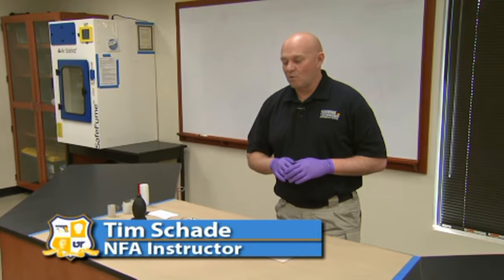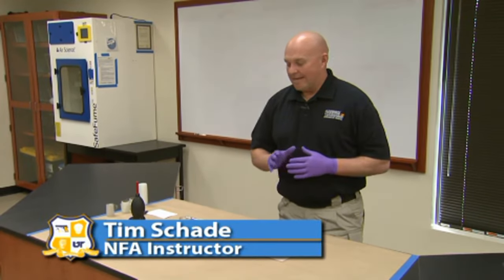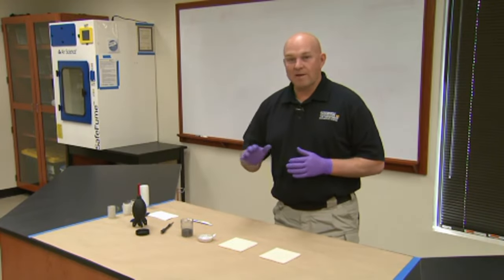Hello, we're at the National Forensic Academy, and what we're going to demonstrate now is lifting latent prints with magnetic powder.